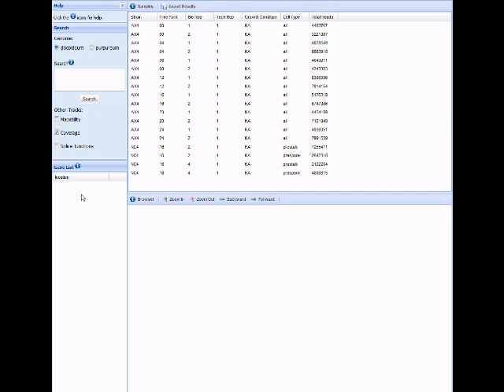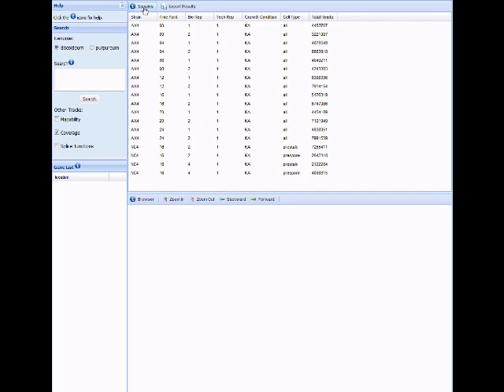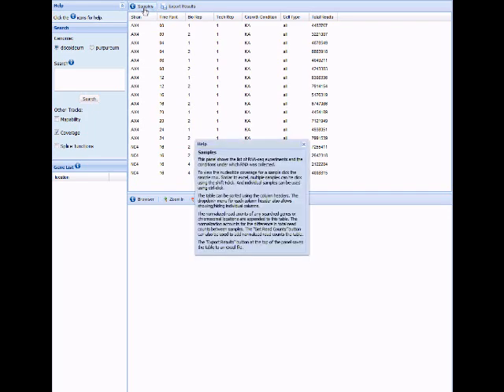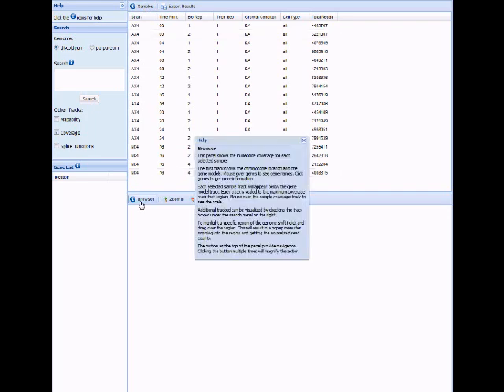All of the information provided in this tutorial can be accessed by mousing over the information icon over the search or the gene list panels, and by clicking on the information icons for samples or the browser.